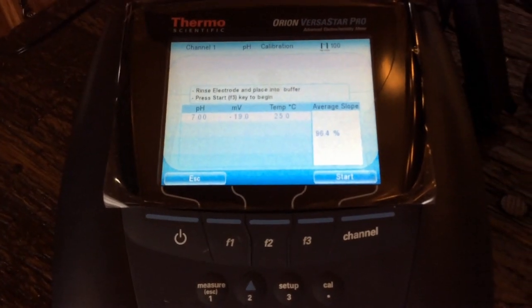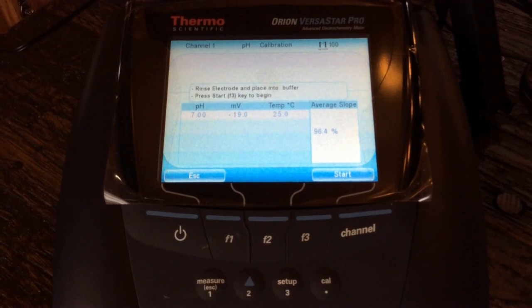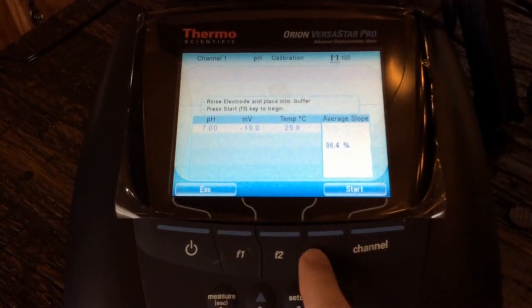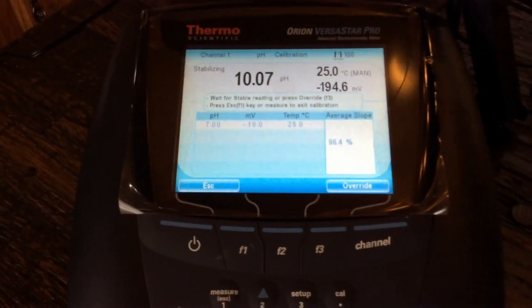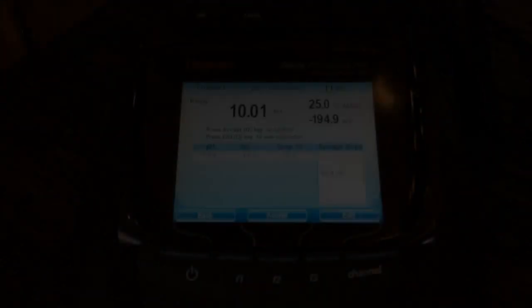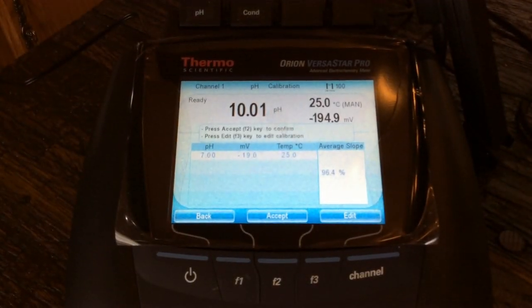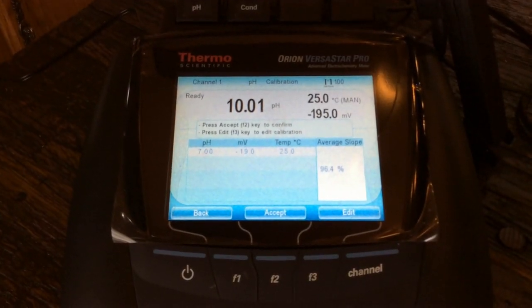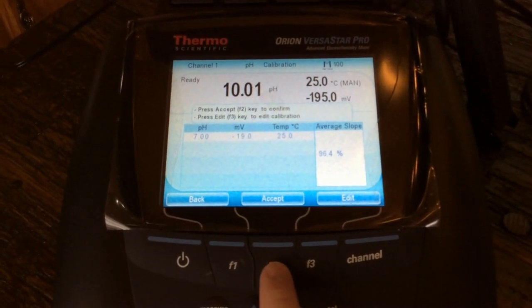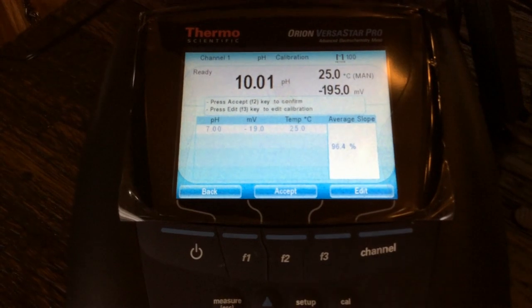Now it tells us to rinse the electrode and place it into the next buffer. I've placed it into our 10 buffer, and now I'm going to hit start for our next calibration point. We can see it is trying to calibrate to the 10. And there we go — we have calibrated to the 10. It is telling me it is ready. So we can either edit the calibration or we can accept. I'm going to go ahead and hit accept calibration.